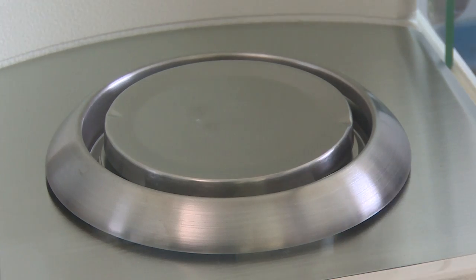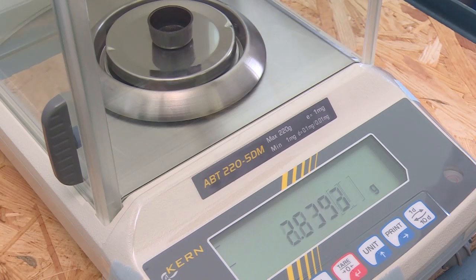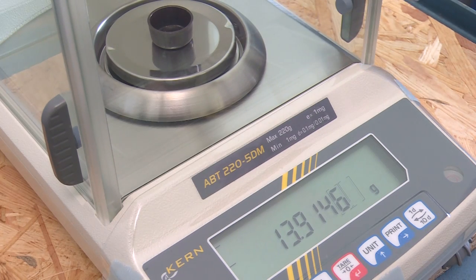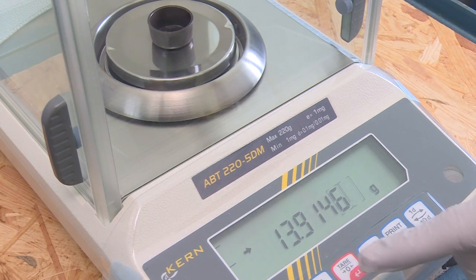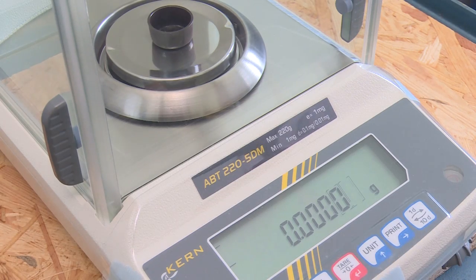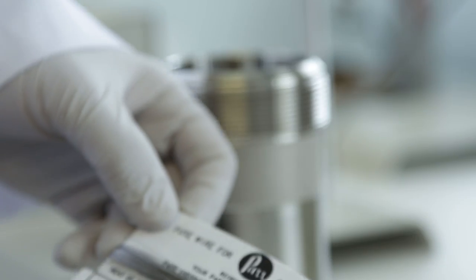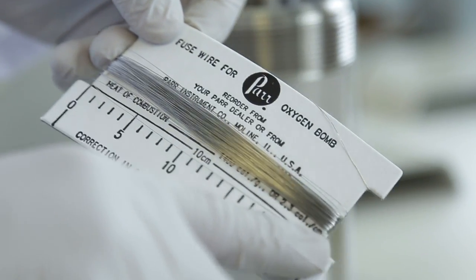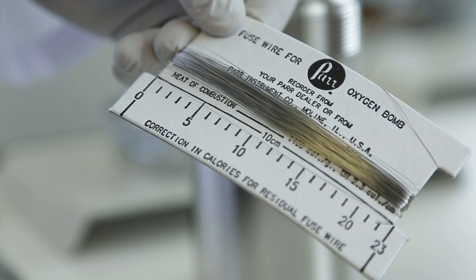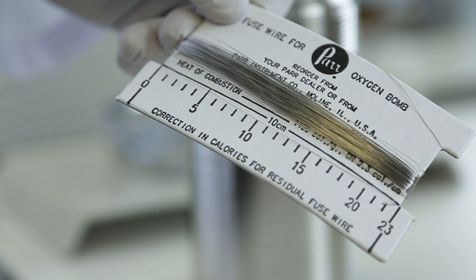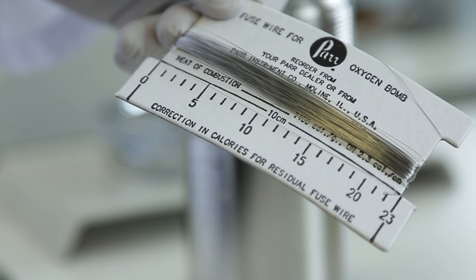A balance for weighing the sample, fuse, etc. with a resolution of at least 0.01 mg is preferable and is recommended with a sample mass in the order of 0.5 grams or less. The ignition or fuse wire is constructed with nickel chromium 0.16 mm to 0.20 mm in diameter.